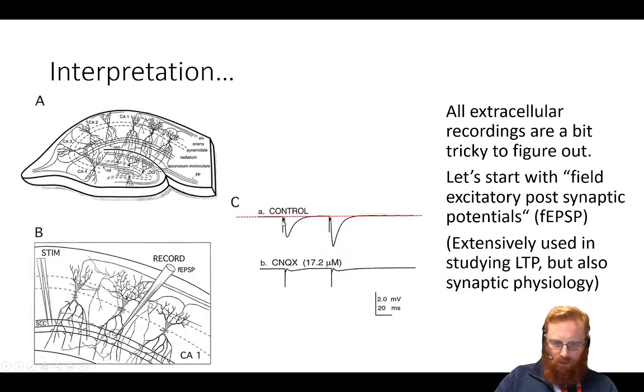So the first little straight up and down line is probably just what's called the stimulus artifact. That is the fact that you're stimulating the electrode, zap the tissue, and you're able to record that. But then the next bit, this is the local field potential. Now, it goes down the page. Why does it go down the page? Because when you have your electrode in amongst the dendrites, you're seeing sodium go into the cell through those AMPA channels, and a positive sodium going in makes the extracellular voltage negative because there's slightly not enough positive charges anymore.